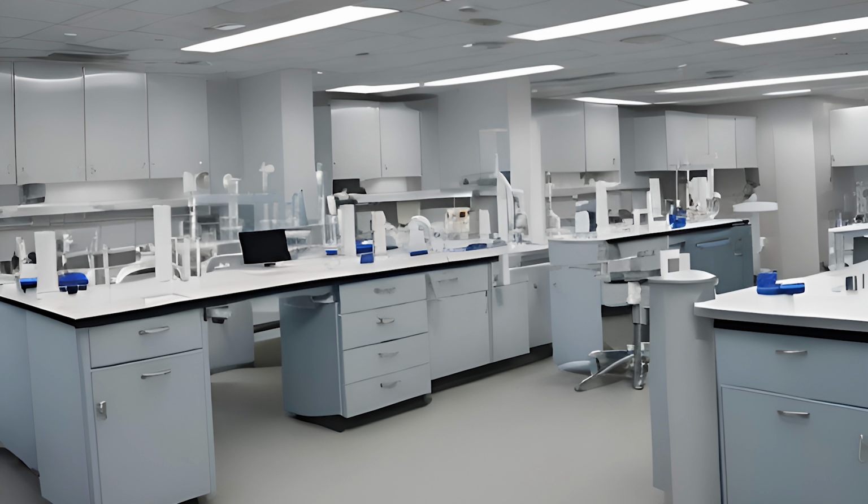Every lab is also going to have a safety shower. It needs to be located centrally in the lab. I need to make sure you have a way to drain that thing, because it's going to put out a lot of water very quickly, and you don't want it to flood the laboratory environment with the chemicals that you are washing off of someone in the act of showering.